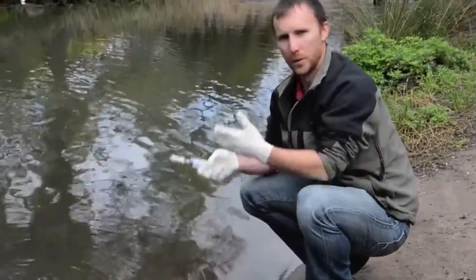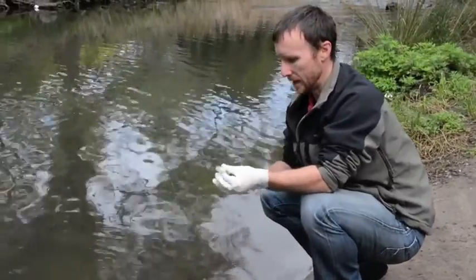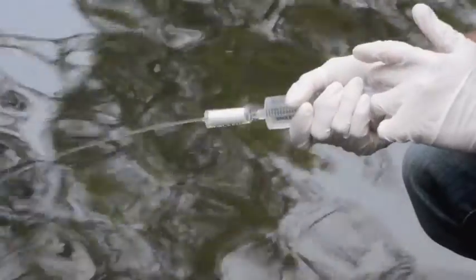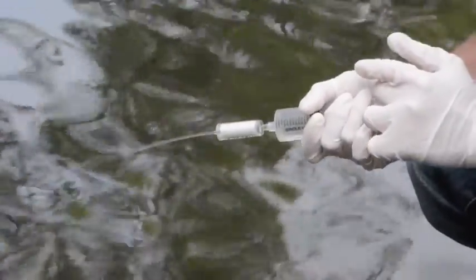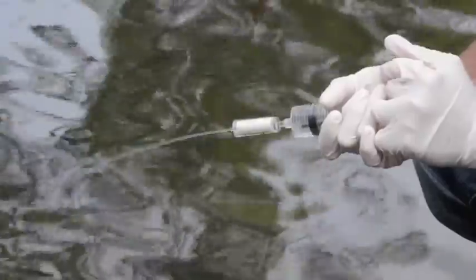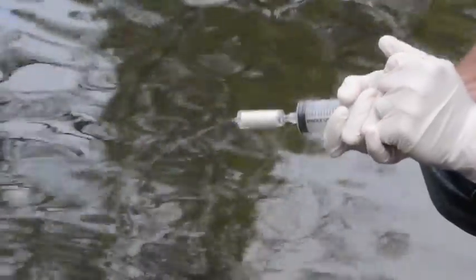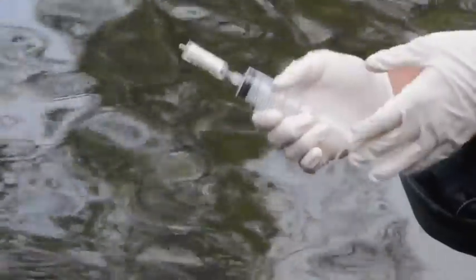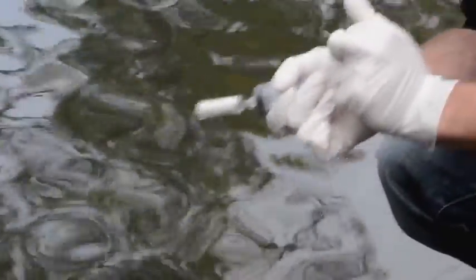That's because the filter is starting to accumulate all the organic matter and sediment in the water. It's starting to get really difficult to push the water through the filter now. We're at 400 millilitres, so that's plenty — I'll stop there.